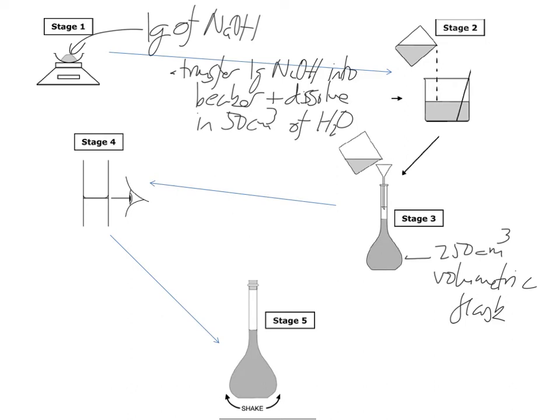Now, we need to make sure that all the solution gets transferred. There might be residue on the inside of the beaker, there might also be residue on the stirring rod, and there would then be residue on the funnel at the top of the volumetric flask. That's a problem if it's not been transferred into the volumetric flask.